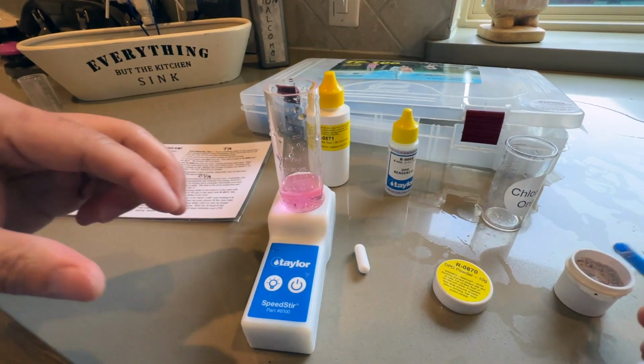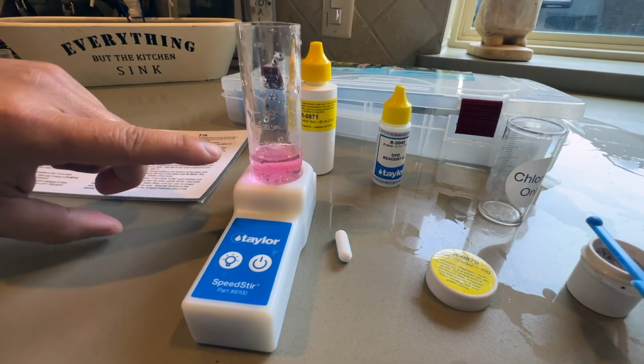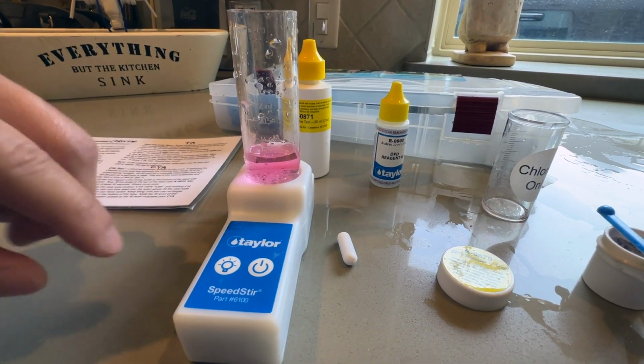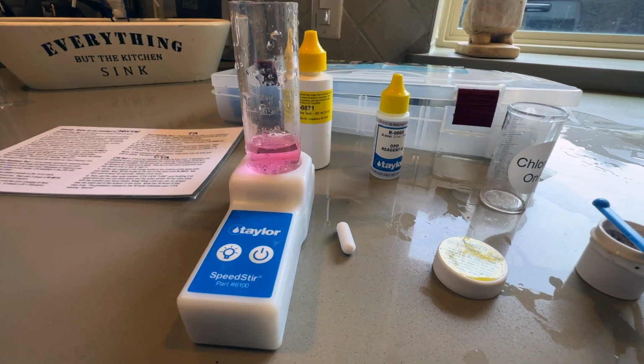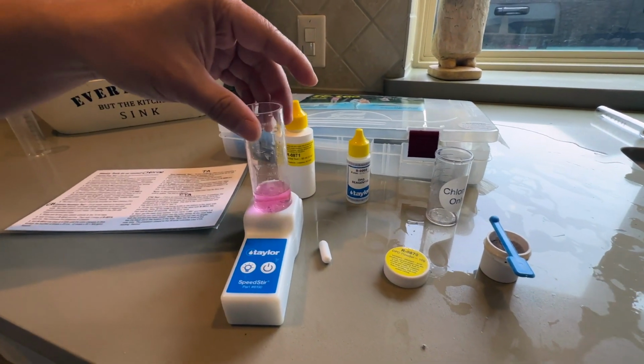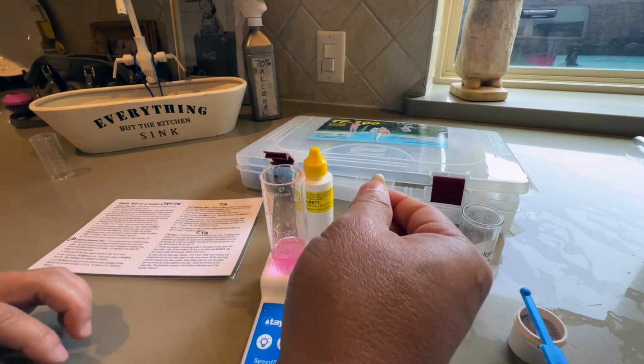All right, so once I've added that scoop, you'll notice that the water turns pink. If your water does not turn pink, that means you don't have any chlorine, and you don't need to go on measuring your chlorine level. You have no chlorine in your water. Since mine turns pink, that means I have chlorine. I'm going to go ahead and drop this in.